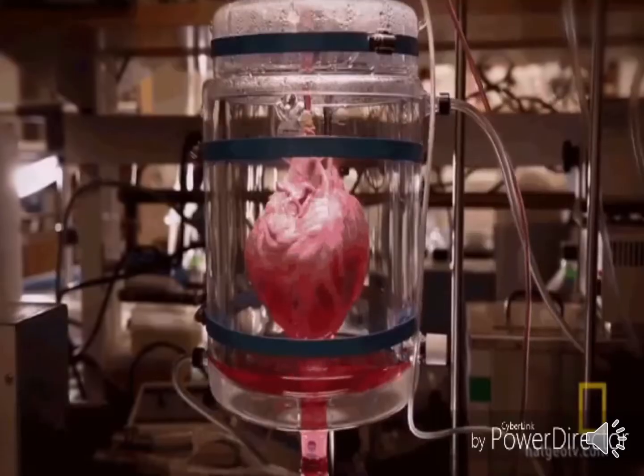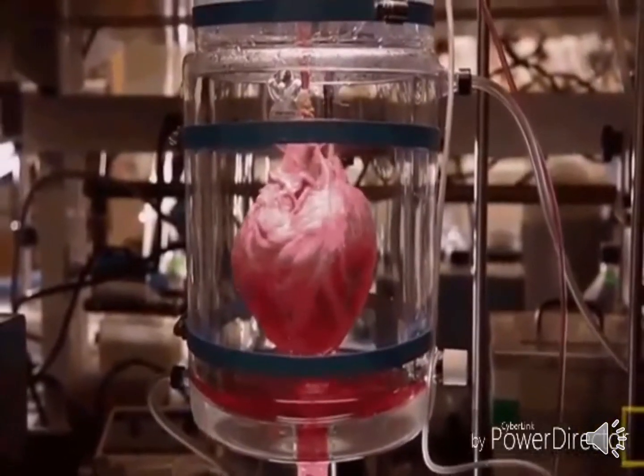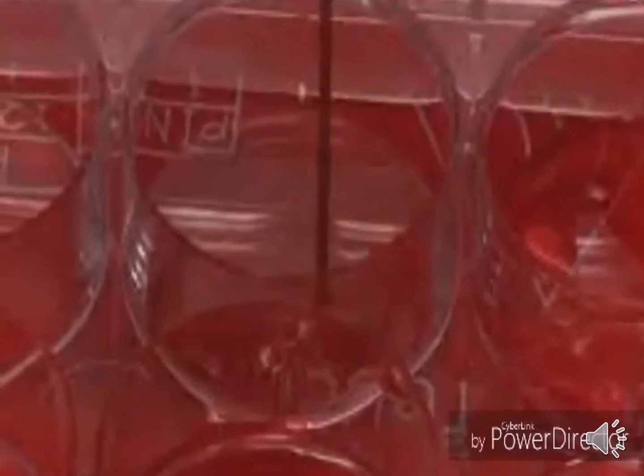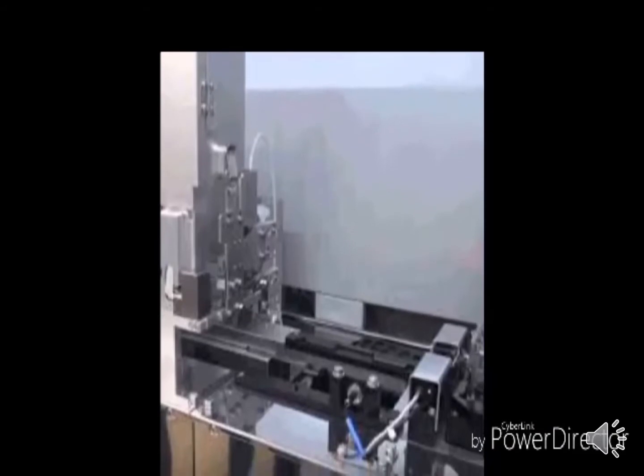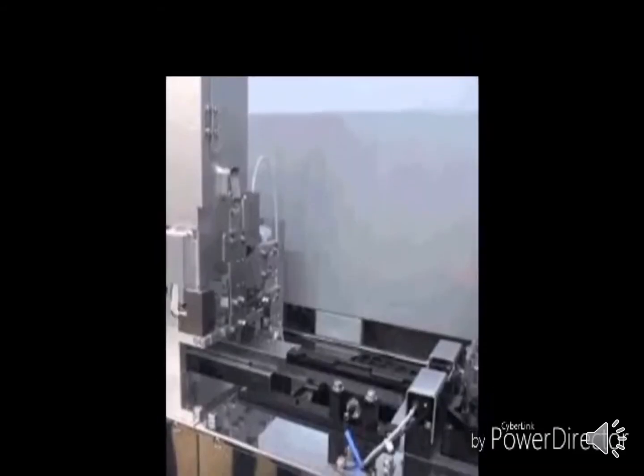Other major points in the history of bioprinting were 2007, when the first bioprinting company was founded, and 2009, when the first commercial bioprinter, NovoGen MMX, was introduced. Thank you very much for listening.